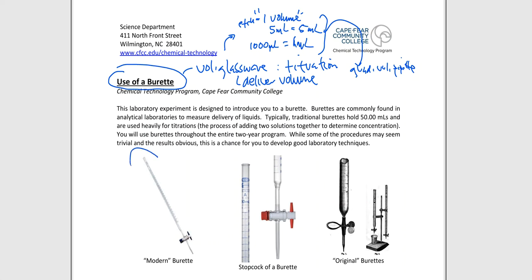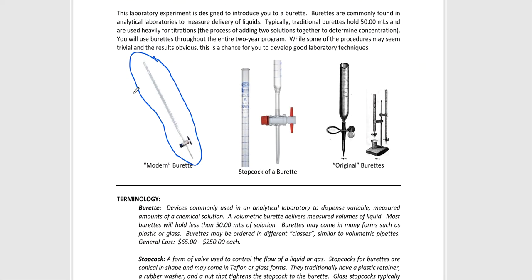So this is what a Burette looks like. That's what you're seeing here on the picture to the left-hand side. And a Burette is volume based. It is for me to fill it with volume of some sort. And this could be water, and it will be water in the first part of this lab exercise. So I'm going to fill it full of water, and then there's a valve on the bottom of this Burette. So here is the valve, and that valve is more properly called the stopcock.